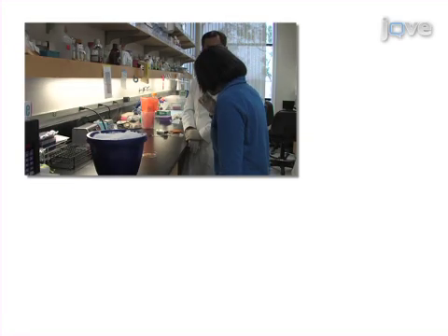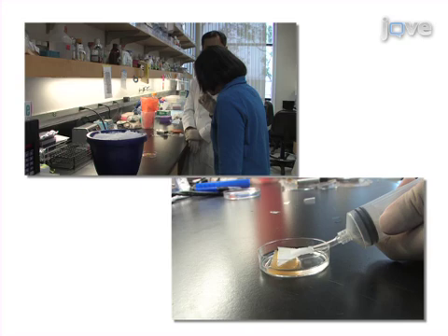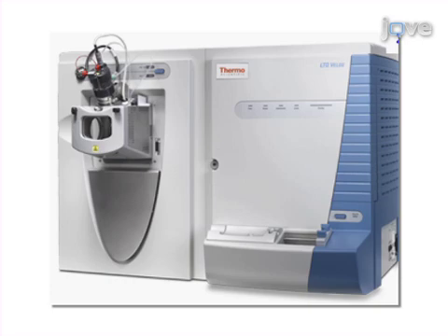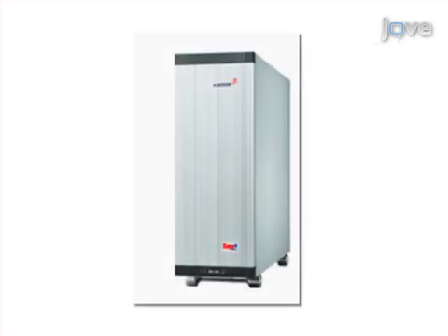Next, collect saliva specimens from volunteers and process through the LLUF probe to sample the saliva, then proceed directly to nanoLC-LTQ mass spectrometry and analyze the data from saliva samples with and without LLUF probe treatment.